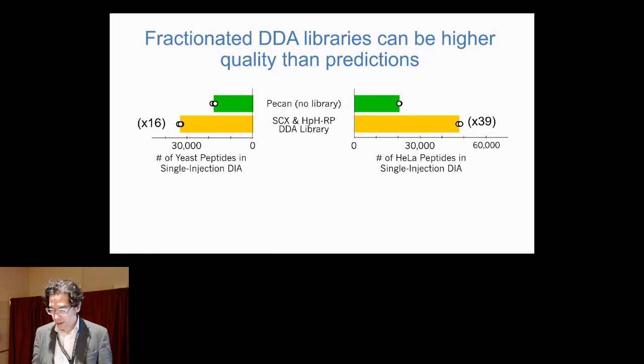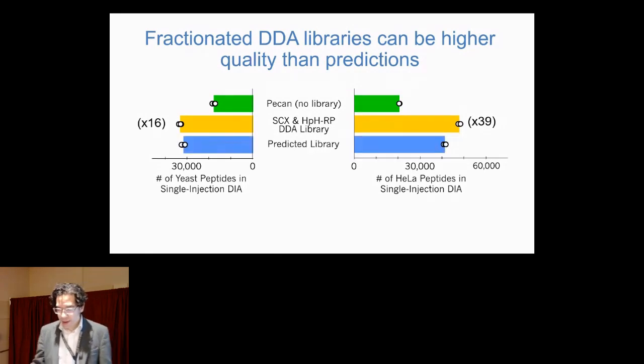of the same sets of samples, so fractionated and then analyzed independently. If we analyze this type of DIA data using library searching techniques, again using Prosit predicted libraries, these large libraries, we're oftentimes still detecting fewer peptides with our predictions than with our DDA-based libraries.